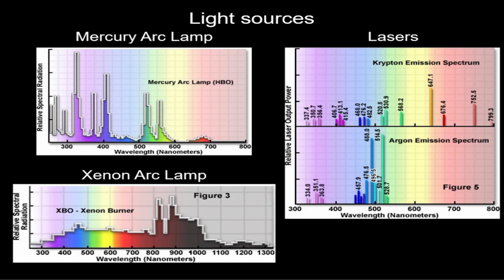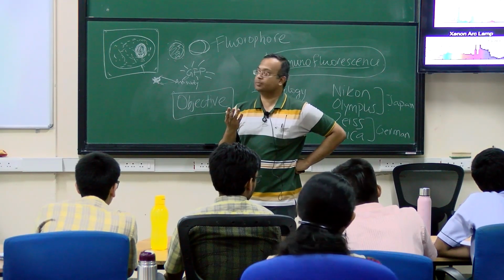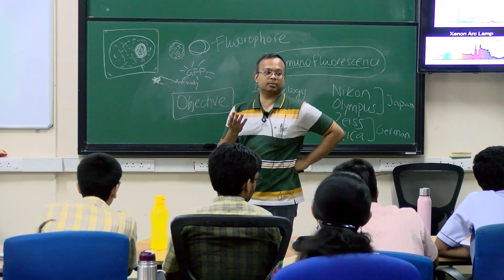And then the last thing is the light source. Earlier, when there was no bulb and other things, people used to use candle light or some other light.